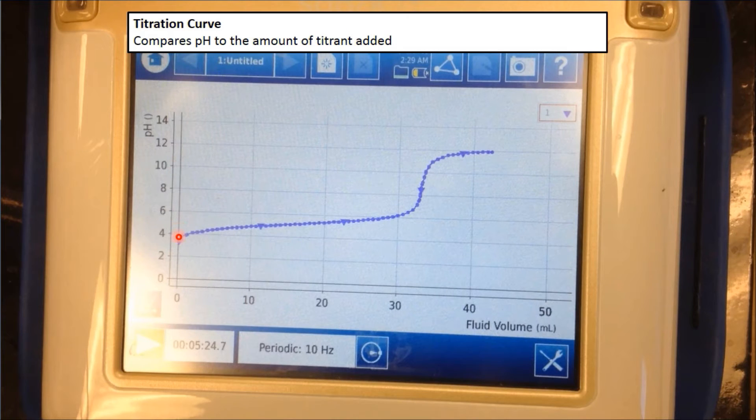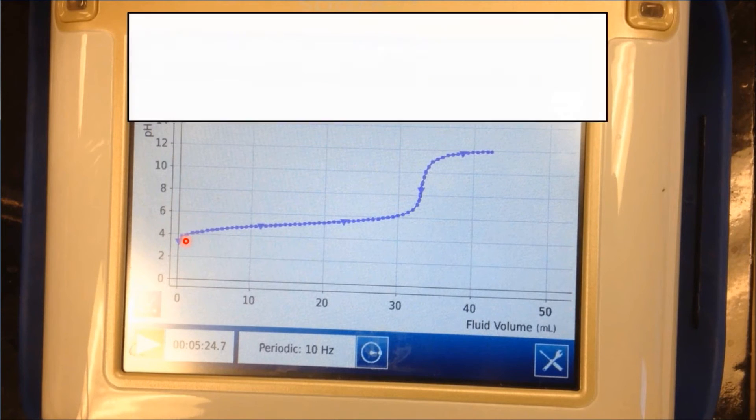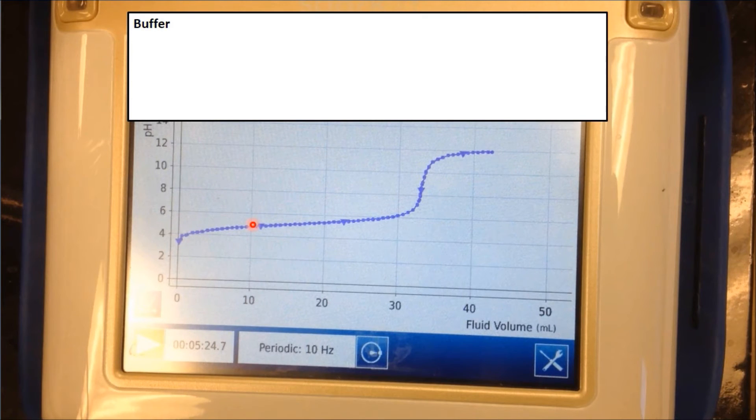The first point on our titration curve is right here, and it signifies the pH of the acetic acid before any NaOH was added. So that would be around 3.5 maybe. The next part of our titration curve is the buffer region. This region right here is when the pH doesn't change much and it's relatively flat. It can only occur when there's something weak, so like a strong acid and a weak base, a weak acid and a strong base, or even a weak acid and a weak base. In our case, we were titrating a weak acid with a strong base, acetic acid and NaOH, basically.